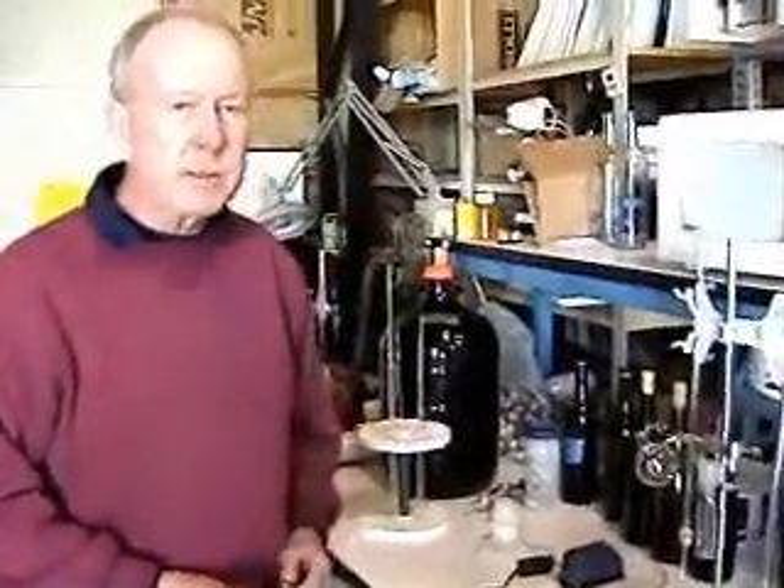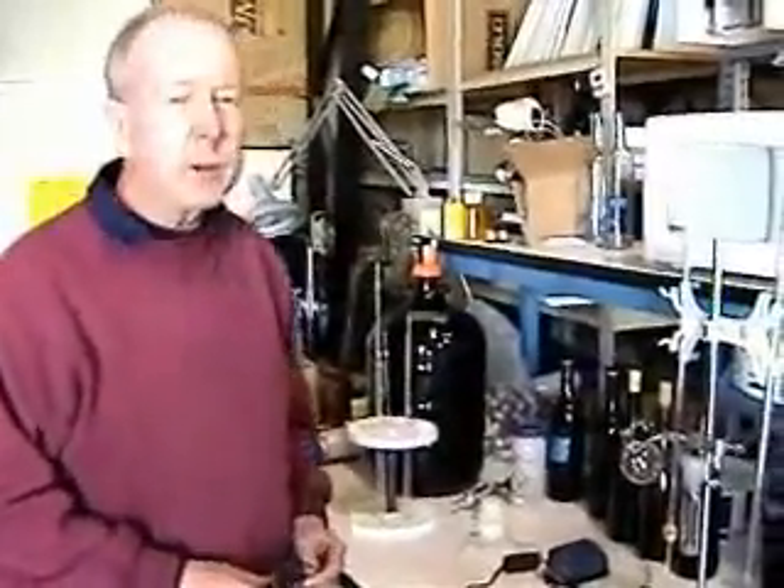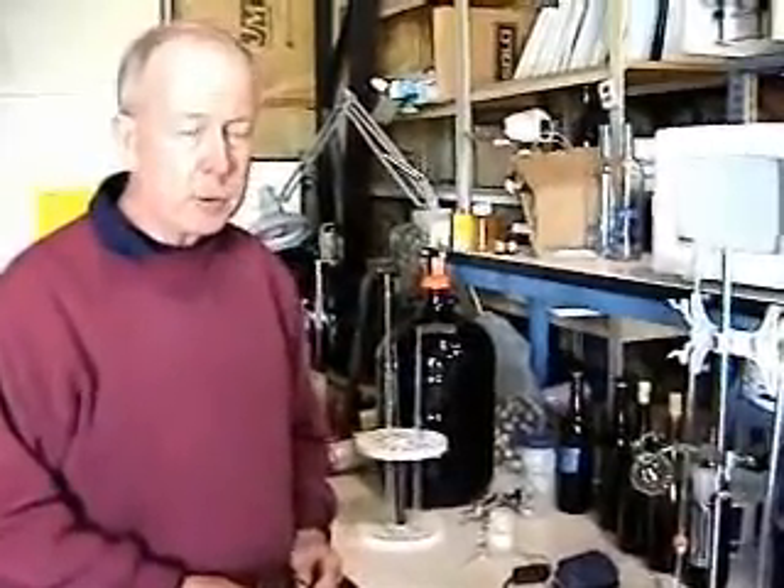This is a demonstration of the SO2 kit that Valley Vintner has developed for use in determining SO2 concentrations in wine. To start off, I would like to show you how you do the reagent preparation prior to doing the test.